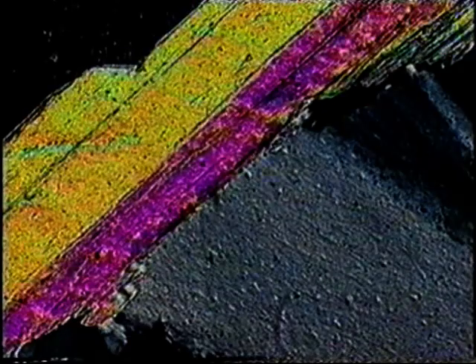Small flakes cut transversely resemble prismatic minerals like sillimanite. But the elongate grains are really plates, as shown by the equant first-order grey grain here.